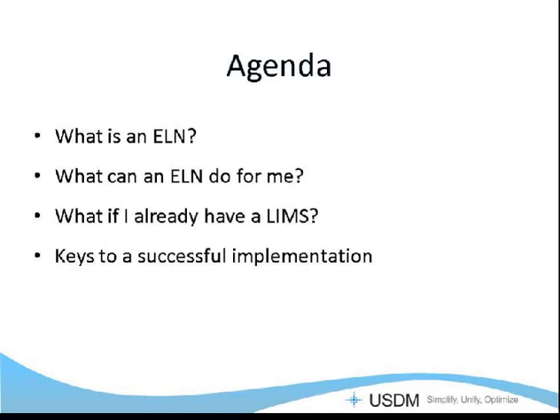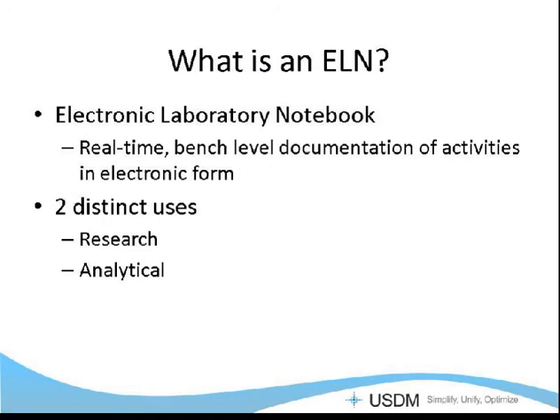So today we're going to give an overview of what an ELN is, what it can do for you in your laboratory, what things it can help you with and improve processes in your areas, what to do if you already have systems in the lab and where it can fit into the overall structure of your laboratory, and some keys to a successful implementation. There are some basic project management issues that are applicable to all systems, but there are some specific issues that are involved with the ELN because it's different from other systems in some ways.